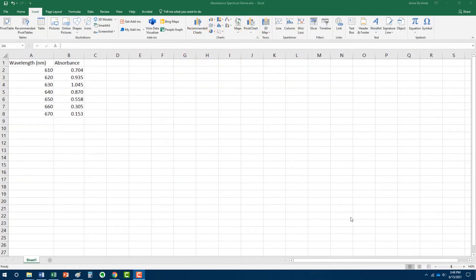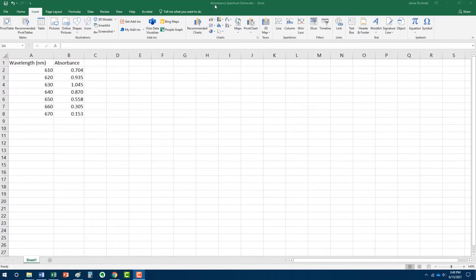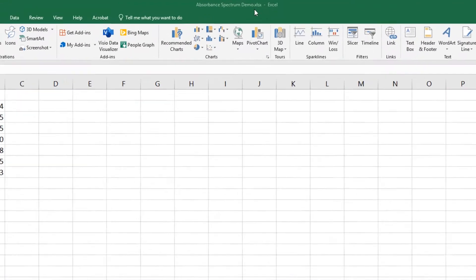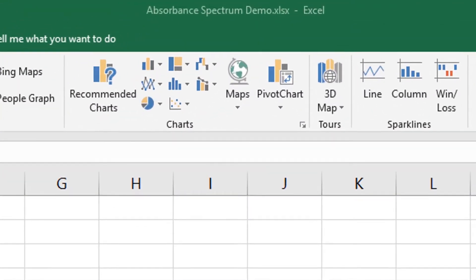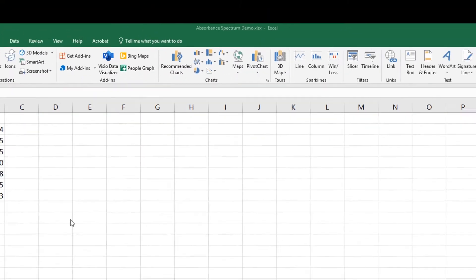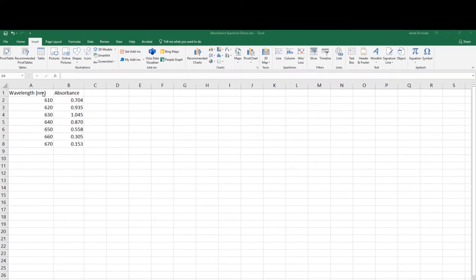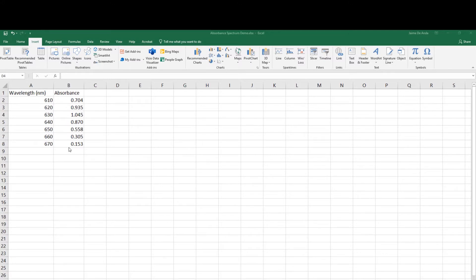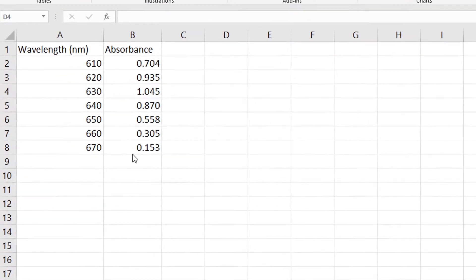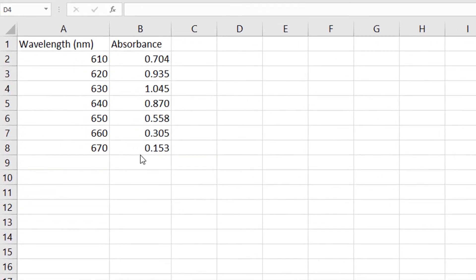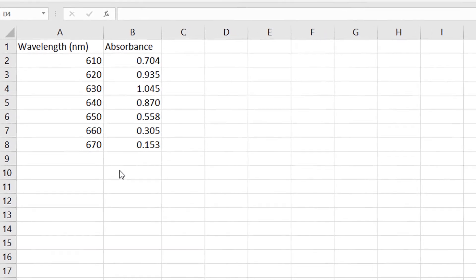Okay students, to continue with our demonstration, I've set up an Excel file. I'm going to call it Absorbance Spectrum Demo, and I have already taken the data that we collected and you saw in the video and placed it into the Excel spreadsheet. I'm going to do the absorbance spectrum now.